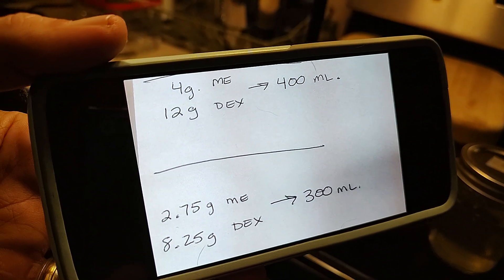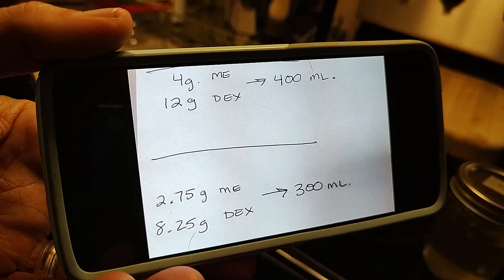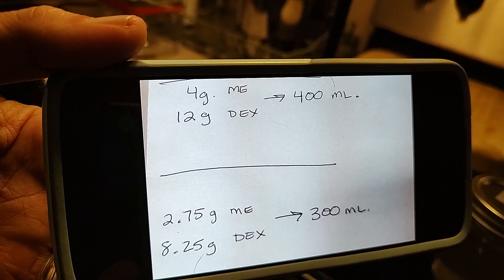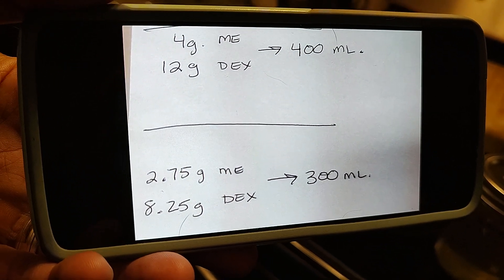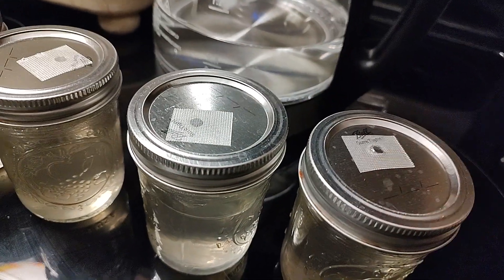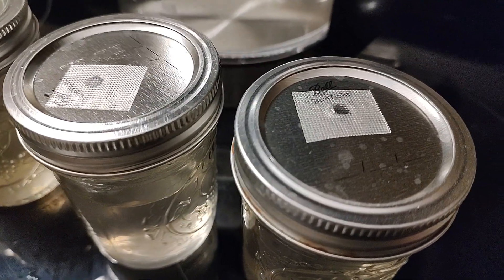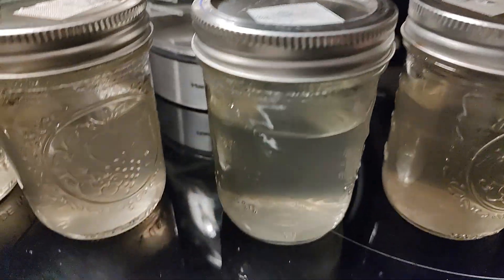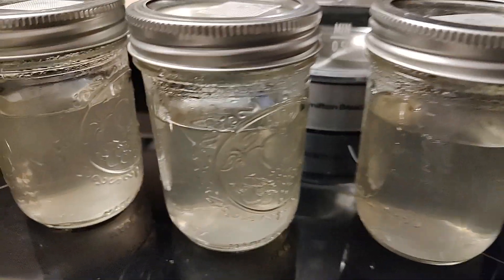Again, here's the recipe: liquid culture LC for 400 milliliters and 300 milliliters — light malt extract and dextrose with purified or clean water. We'll be putting foil over the top since we have these modified lids, and again this is just breathable tape. Pressure cook for 30 minutes at 15 psi. Much love friends!